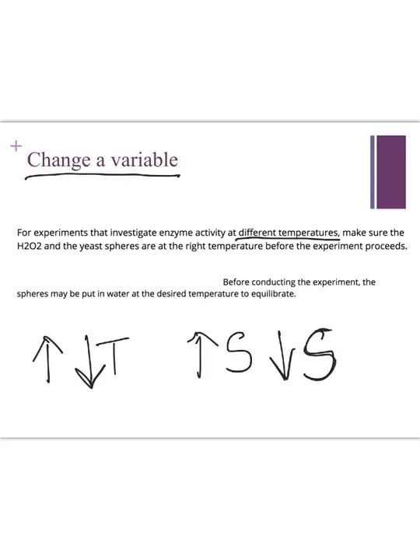You're then going to do this 5 times and take a look at the average. And that would be your relative rate.